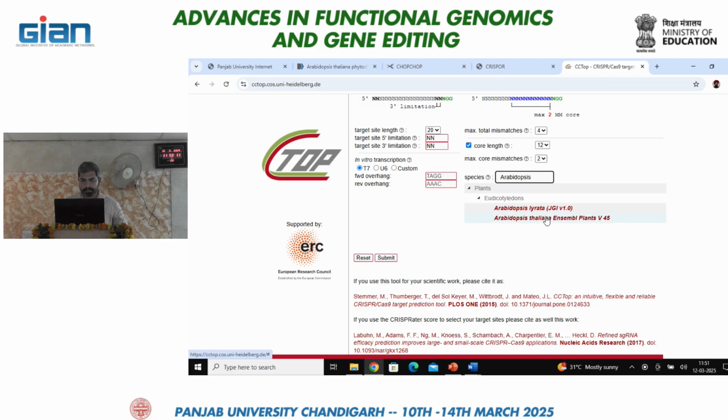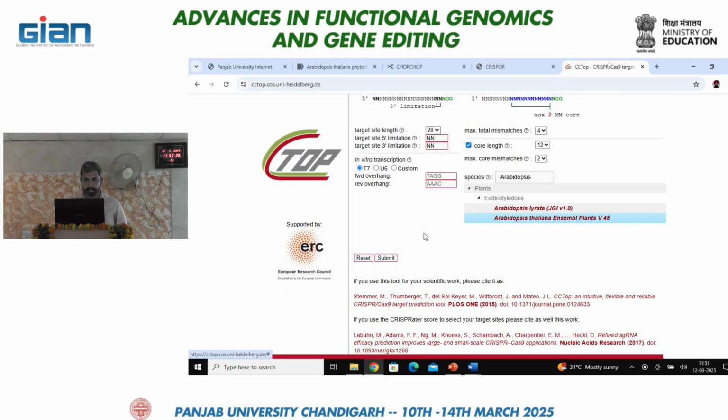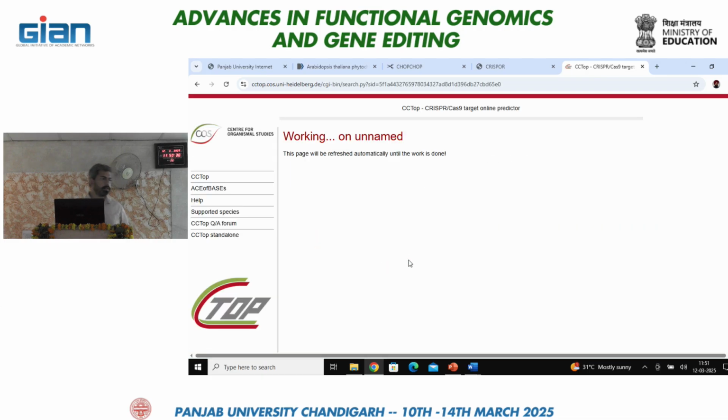Okay. So you can see that the genome assemblies are different in all these tools, so you have to search for the tool which has the updated ones, so that will be relevant. After selecting all this you can just submit, and it will also take some time.